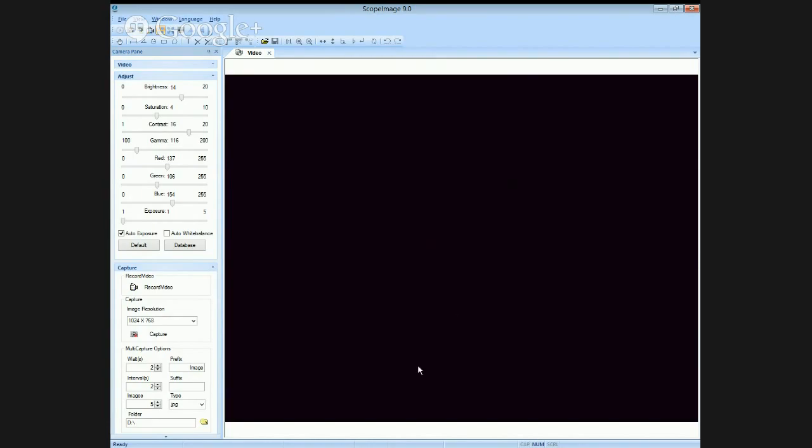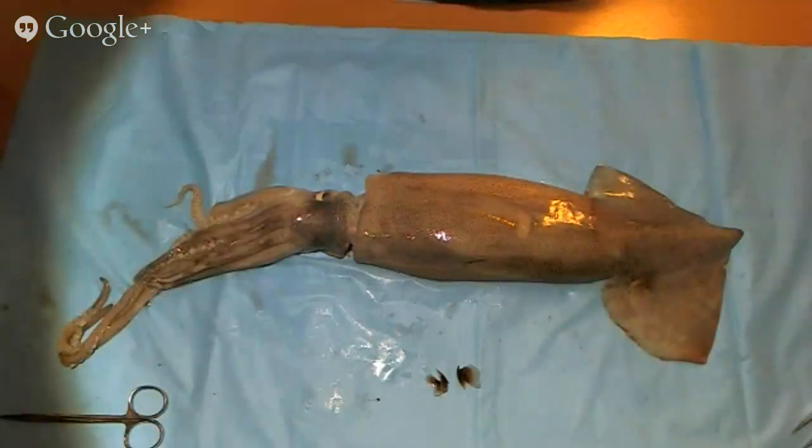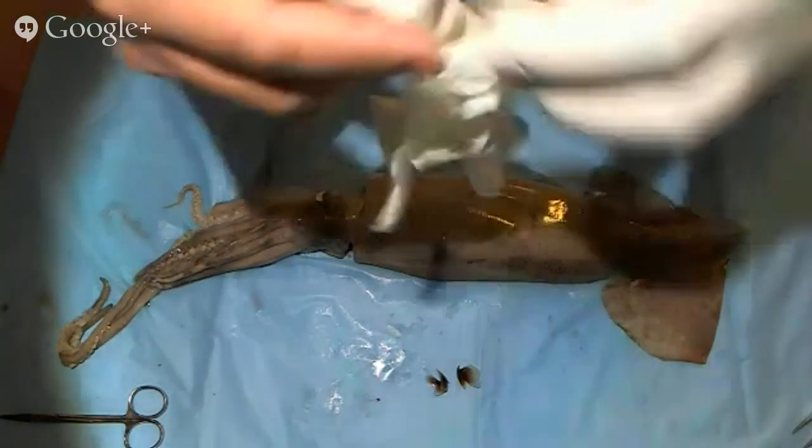All right, so let me switch back to, okay, so we're back with the squid. I'll put my gloves back on.